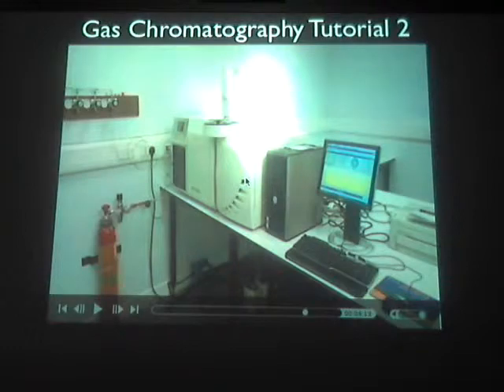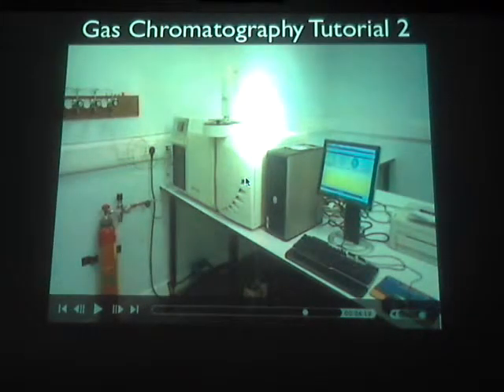So a lot of this that we used to do, well, we've done in Chem 1, even in Chem 2, it's done mechanically now. It's done by instrumentation. For example, you notice how it burned the sample. And that previous one had a little flame there. We did flame tests, and we were able to identify things based on the flame test. What color was the flame? Remember, back in Chem 1. But now, nobody really does flame tests like that in a lab anymore. Most of these things are done by instruments. Obviously the chromatography we're going to do tomorrow in the lab, you would not do this kind of chromatography for the most part. It would be done by instrument.